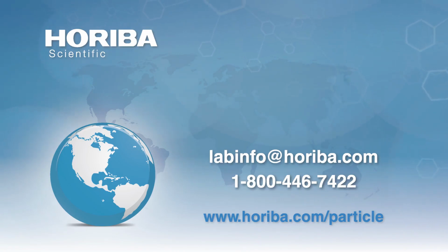So the person in front of the instrument, there's two things the operator needs to do. One is they need to keep good records and stay organized. I mean, in a decade, I did run across one operator who would grab the wrong bottle of standard and fail the system. But that's a pretty rare case, which is why I pointed out it happened once to me in a decade.